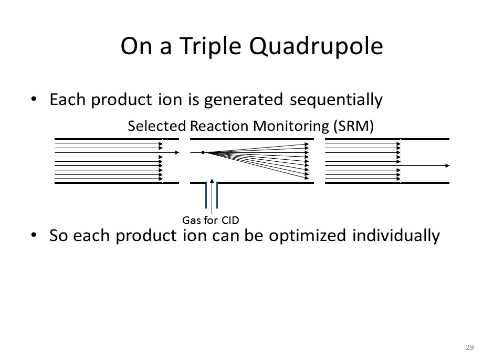It's so much better. So one of the reasons that you can optimize collision energy is because, shown here, each of the product ions, which is what comes out at the very end, out of Q3, is generated individually. So you monitor one at a time sequentially. And the triple quad selects your precursor, fragments it, generates all the ions, but only one is detected at a given time. And so that means in here, in Q2, the collision cell, you have an elevated gas pressure so that the ions can go in and bump into stuff. And then you apply a voltage, a collision energy voltage.